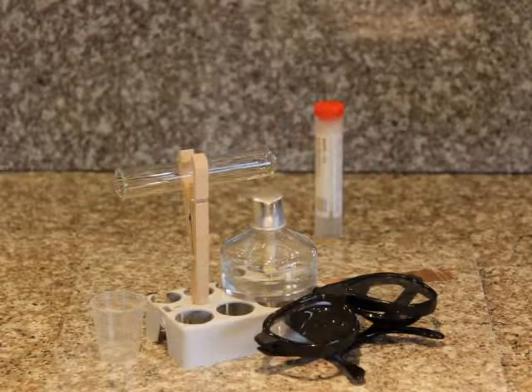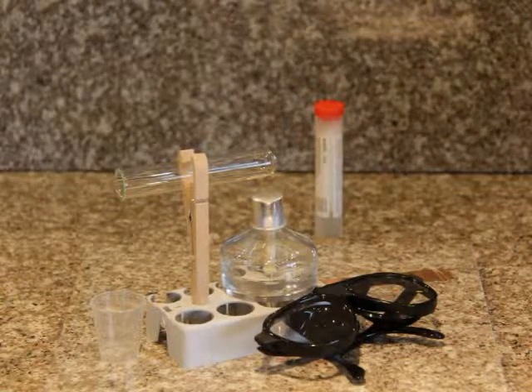Today I will be doing experiment number 10.